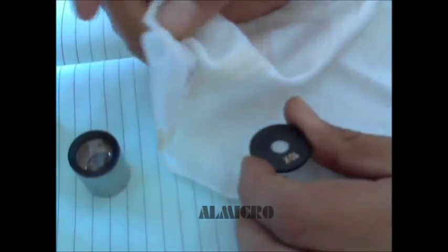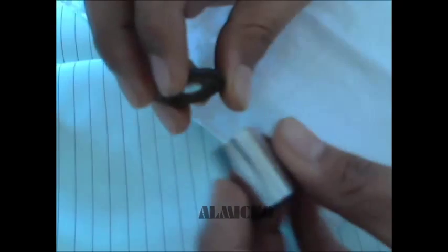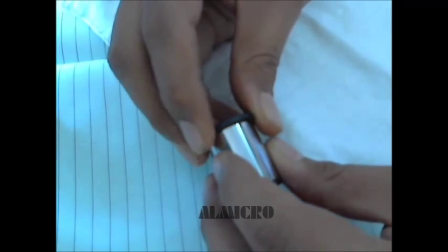Just clean it up. Then clean it again with a clean cloth without acetone. Here also you can clean it up. After cleaning this, you can just put it together again.